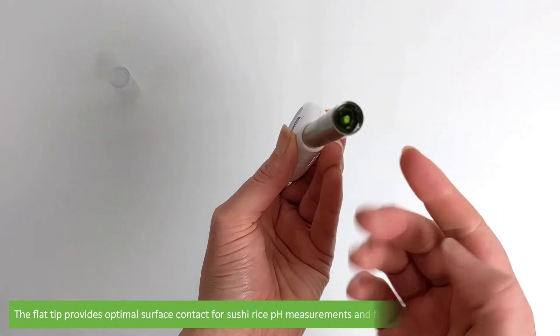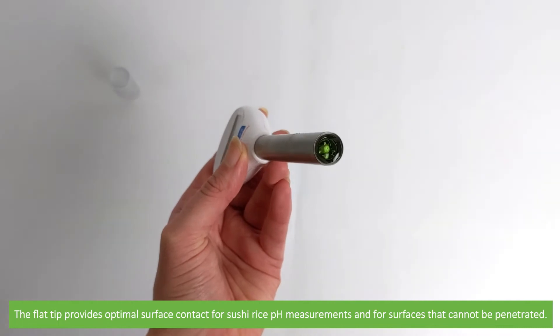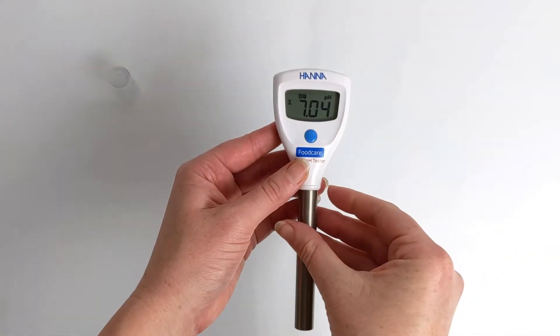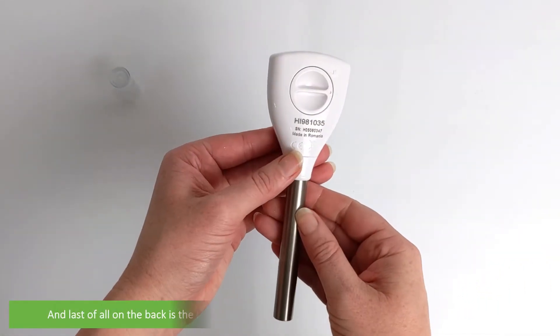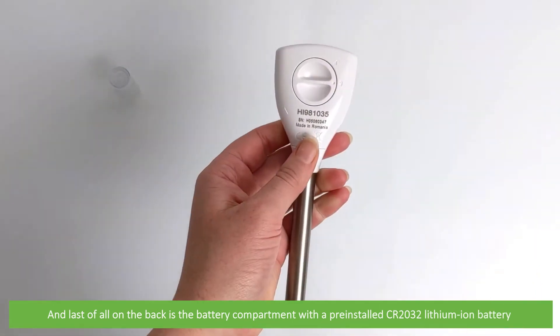The flat tip provides optimal surface contact for sushi rice pH measurements and for surfaces that cannot be penetrated. On the back is the battery compartment with a pre-installed CR2032 lithium ion battery.